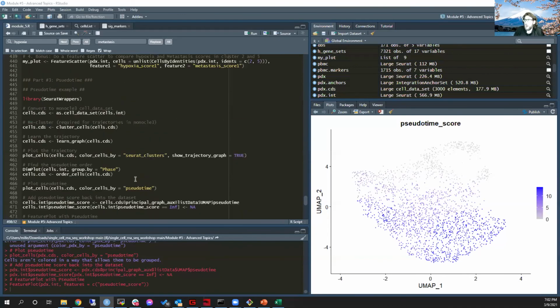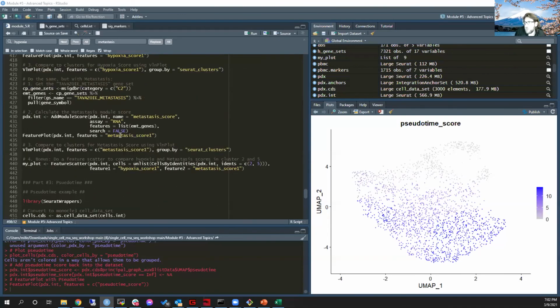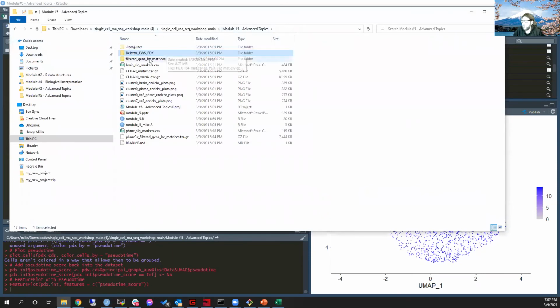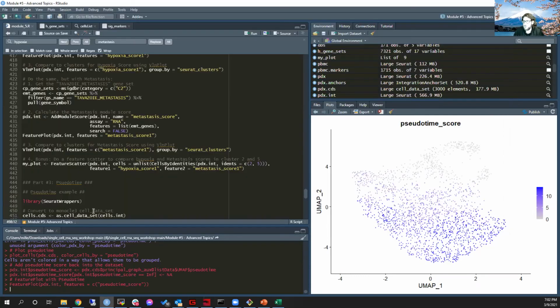Okay, so where did the PDX data come from? You could only find the GEO accession numbers. So I had the data preloaded. You shouldn't have needed to go out and grab it from anywhere because I actually made a downsampled version of those data sets. Or are you asking just like if you wanted to find those, how could you find them?